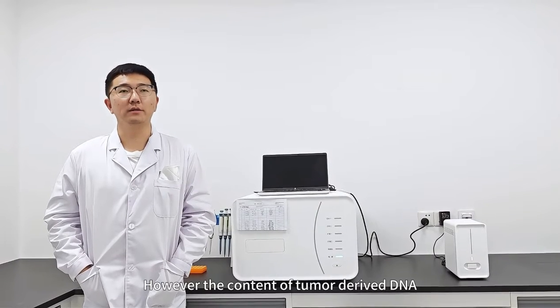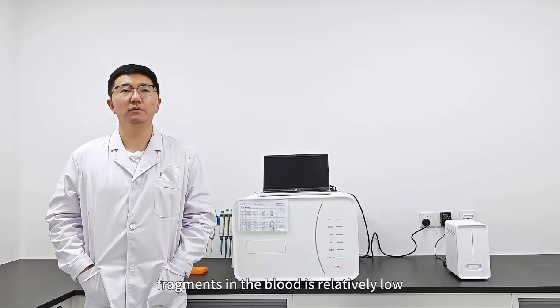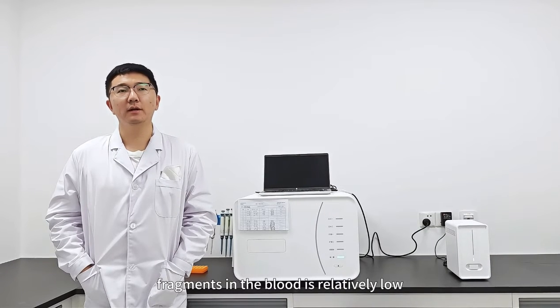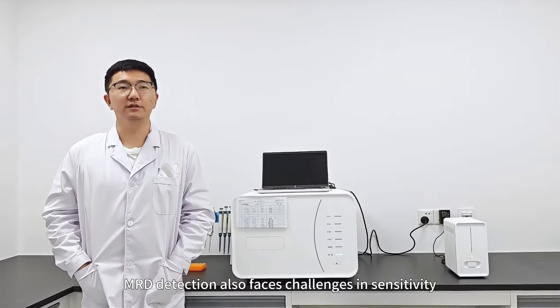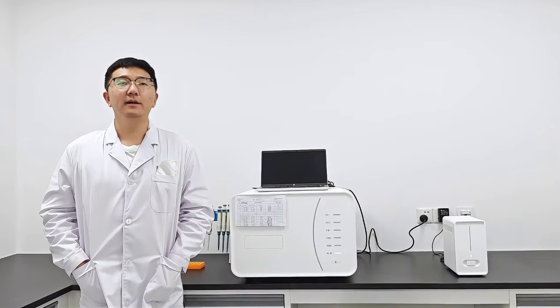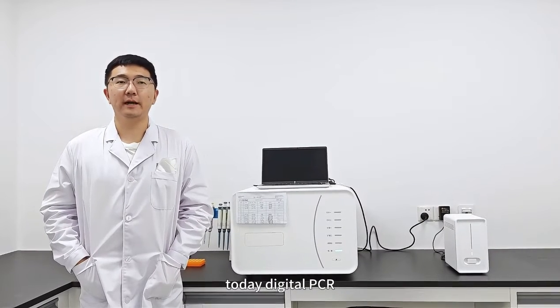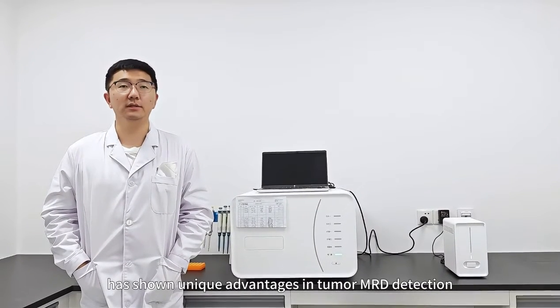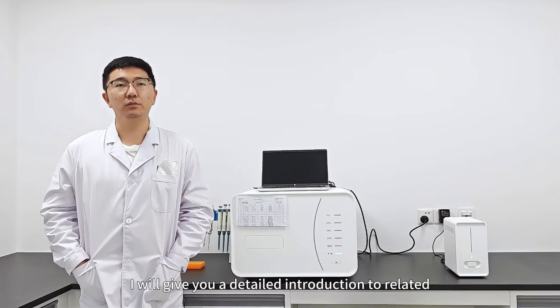Therefore, it is very urgent to conduct MRD detection after surgery. However, the content of tumor-derived DNA fragments in the blood is relatively low. MRD detection also faces challenges in sensitivity and specificity. As the most sensitive nucleic acid detection technology today, digital PCR has shown unique advantages in tumor MRD detection. Next, I will give you a detailed introduction to related applications.